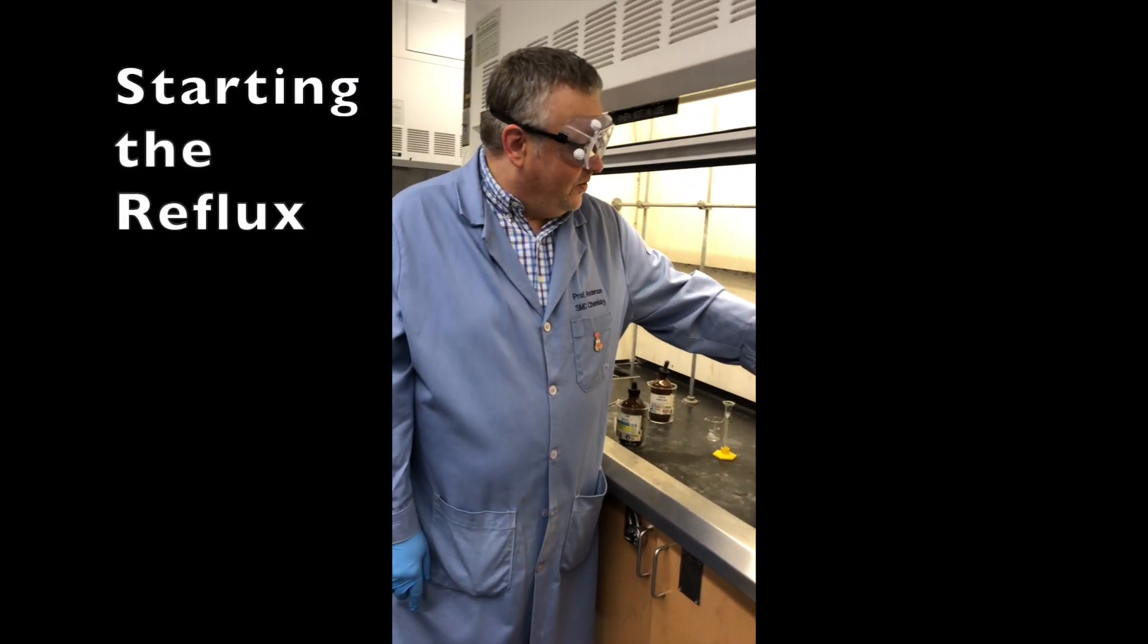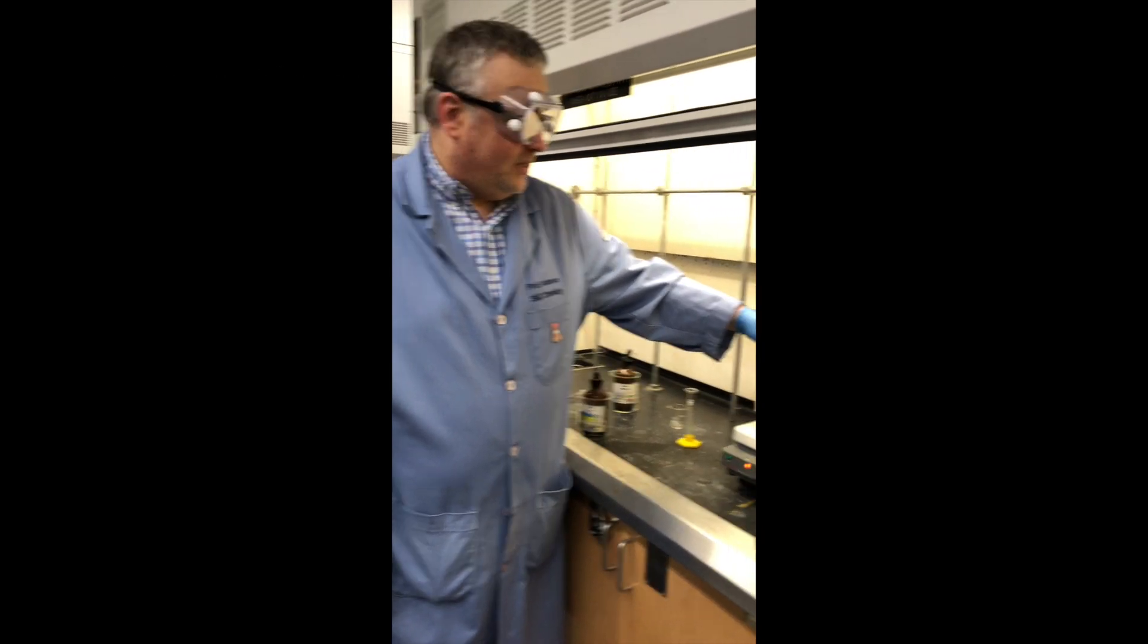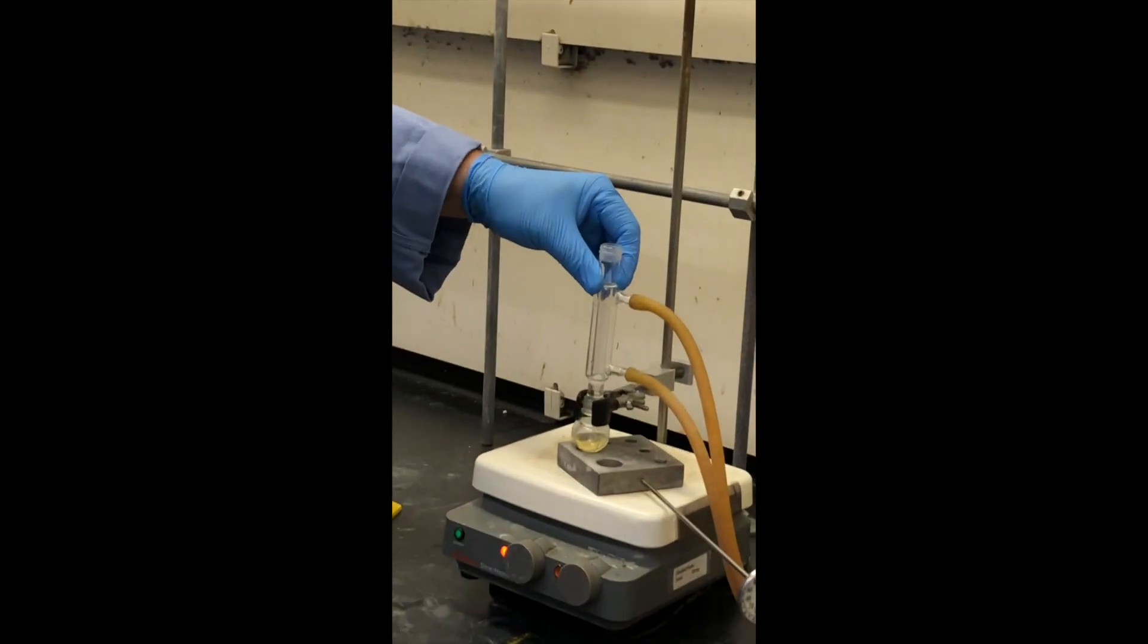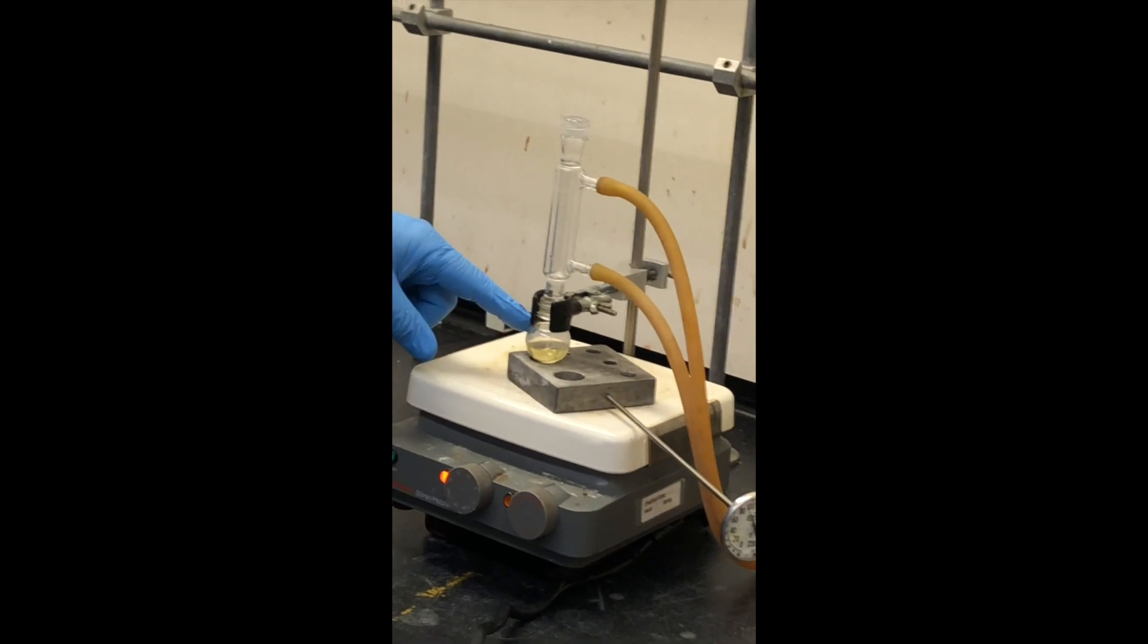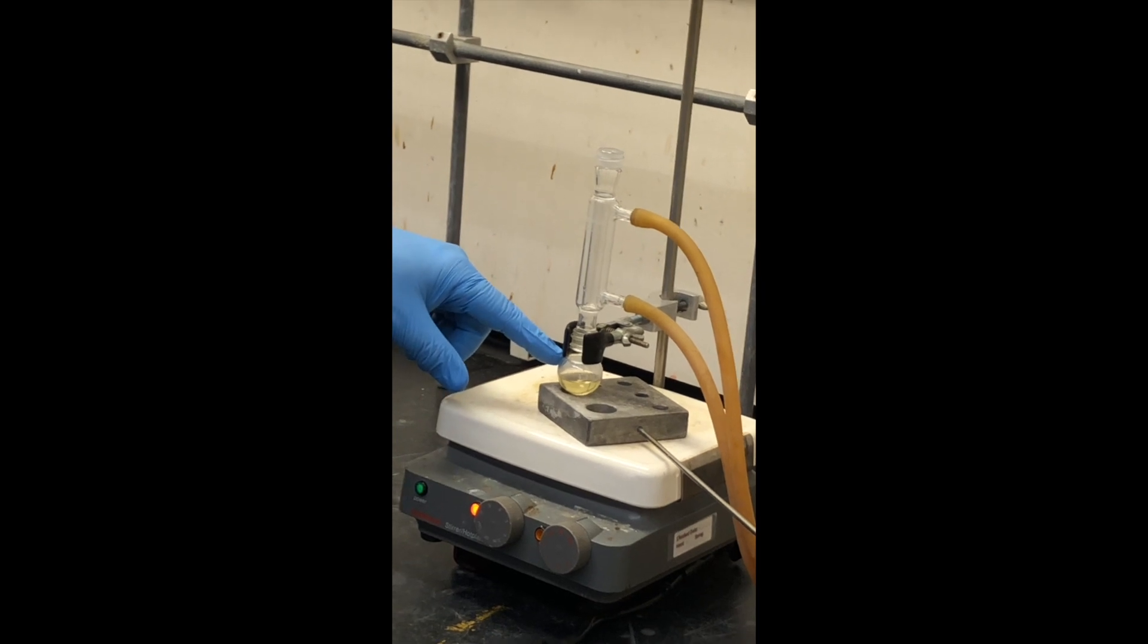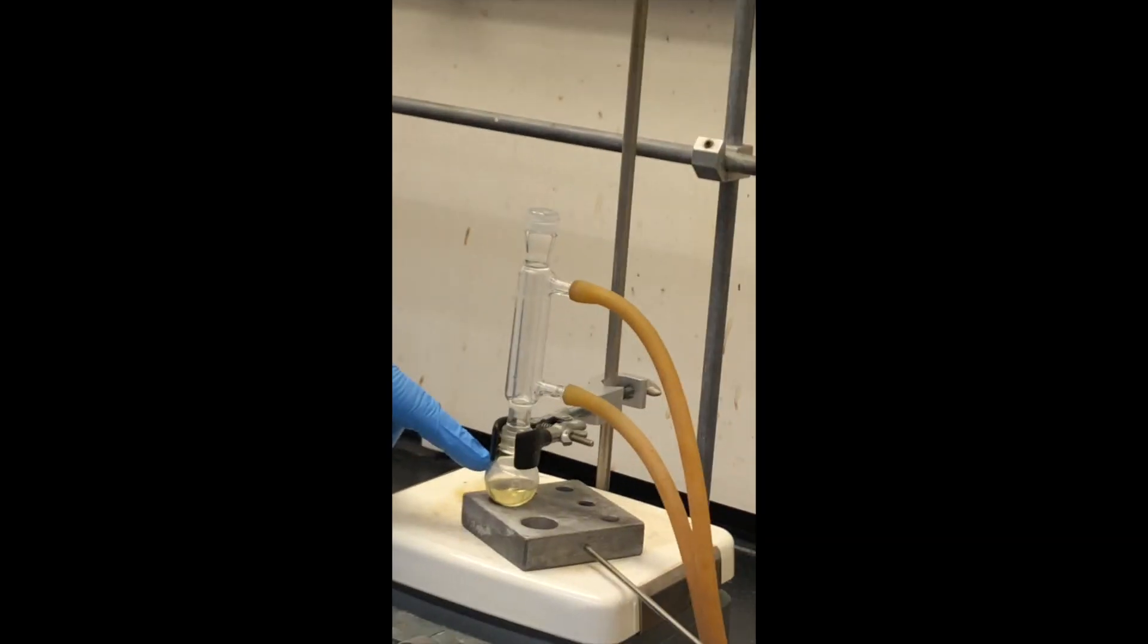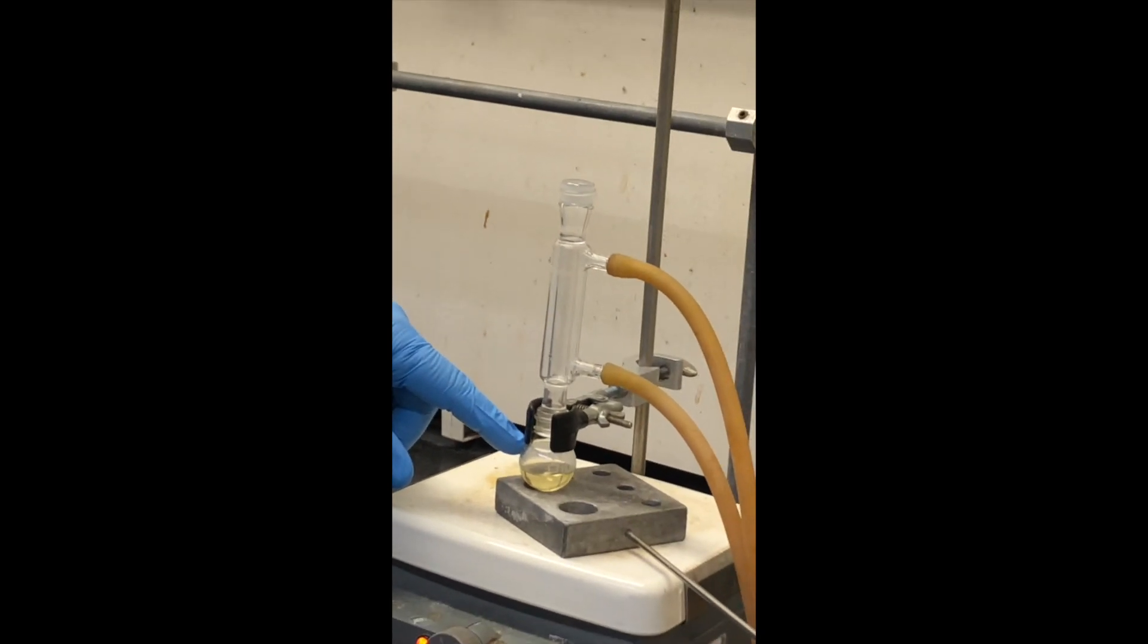We have just completed the setup of the reflux for the alcohol esterification lab. In the flask we have placed approximately 1.3 grams of the alcohol, 2.2 milliliters of glacial acetic acid, and a few drops of the sulfuric acid catalyst.